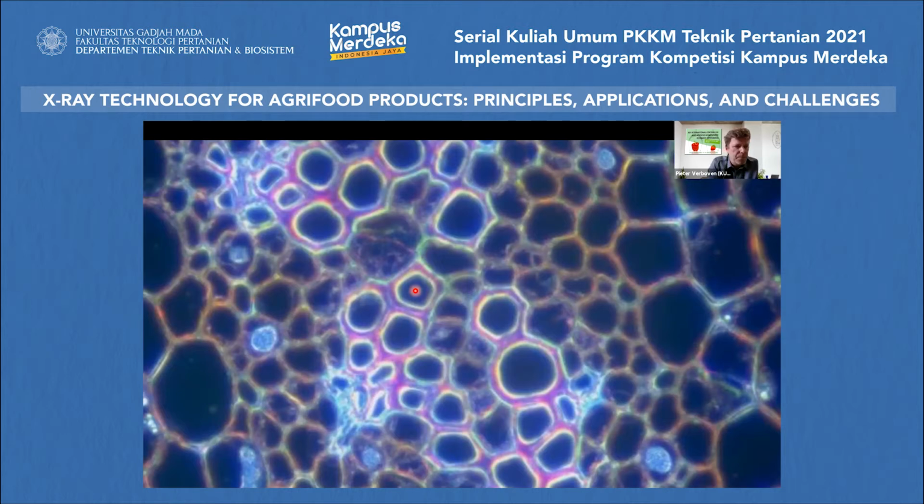The product itself is composed of these cells. They come in a large range of shapes and sizes, and they are interlinked together. And well, this is the engine of the fruit. They make sure that the fruit will develop, and that after harvest, at maturity, it has all the properties that we would like to have in terms of high quality, in terms of taste, firmness, color, and so on. So we need to explore how this structure affects the quality of the fruit, of the product.